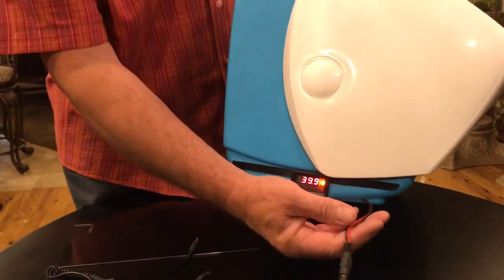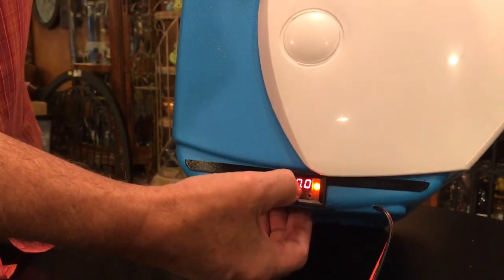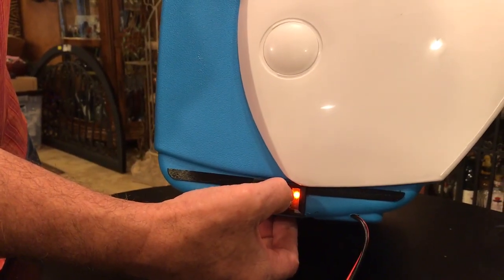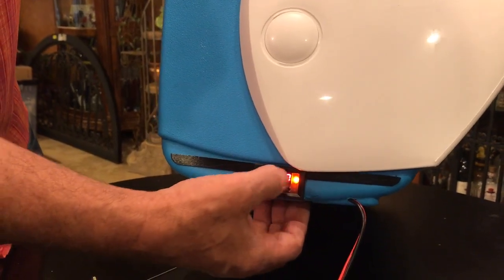So, okay, I want to show this because it's a little bit different than the old unit. The reason it's not reading 40 right now is because the lid's open. Well, it's 39. There it goes. It's just the heater's on, and by the way, when it gets to 40.1, the thing will go off. So it regulates its temperature, and it knows what the current temperature is and what it wants to be.